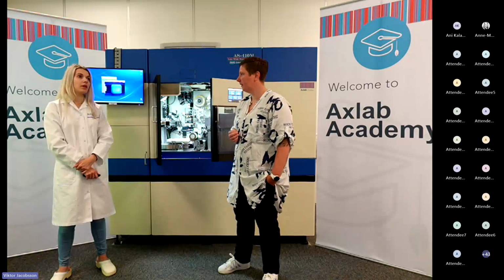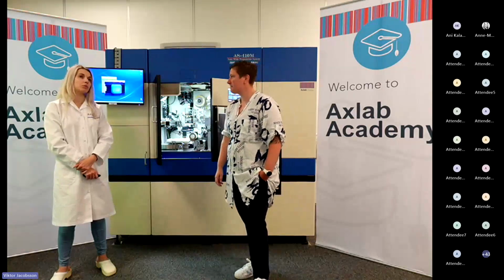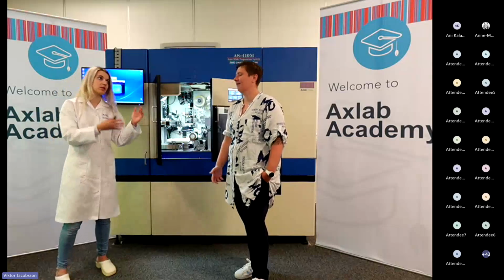Yeah, I think what most people who haven't encountered this will think is that now you've installed these, you can cut back on so and so many people. But it also creates a workflow, and that workflow needs to be supervised to some extent because of changing consumables, loading, and unloading. We talked a lot about the lab tech being hyper-focused on quality and quality assessment.